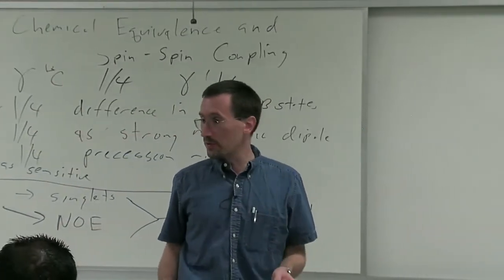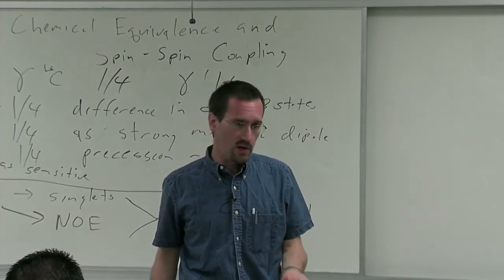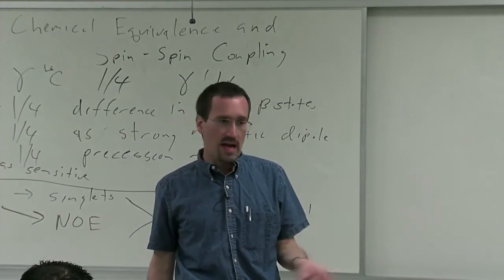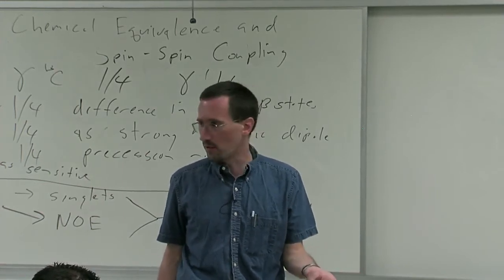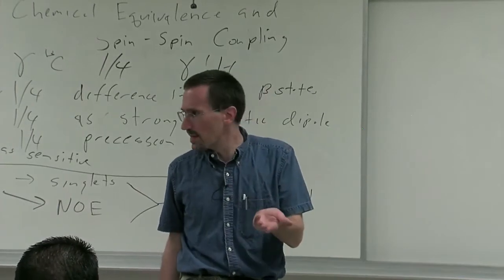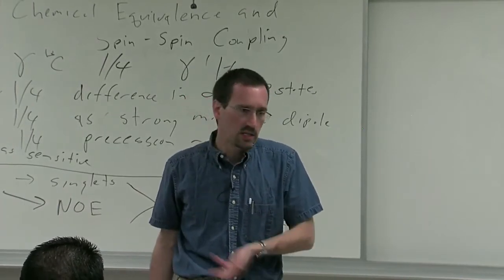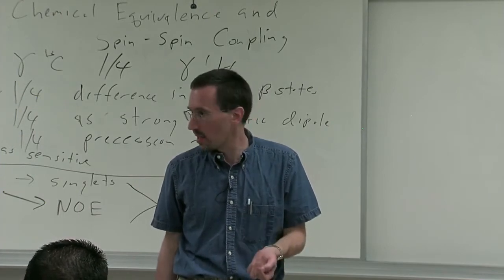It typically will take more sample. You can collect a proton NMR spectrum on strychnine and use 1 milligram of material or even tenths of a milligram. For a carbon, you might want to put 30 milligrams in the NMR tube if you have a chance. You could do it at 10, or even at 1 milligram, but it takes a lot more time.